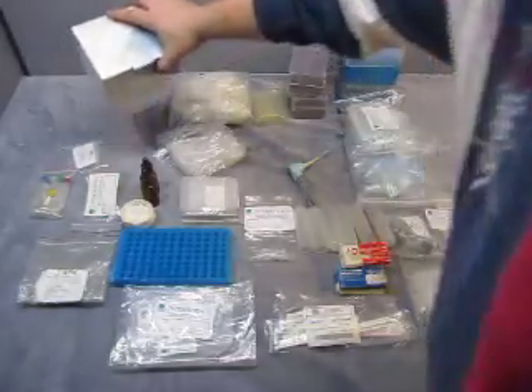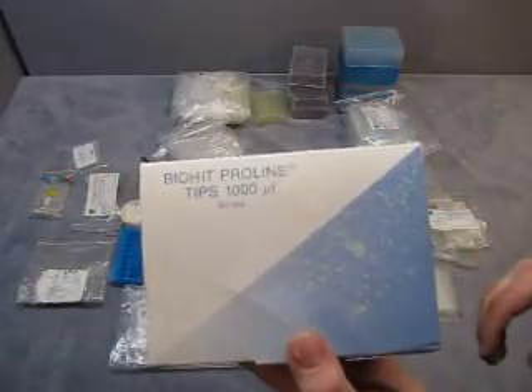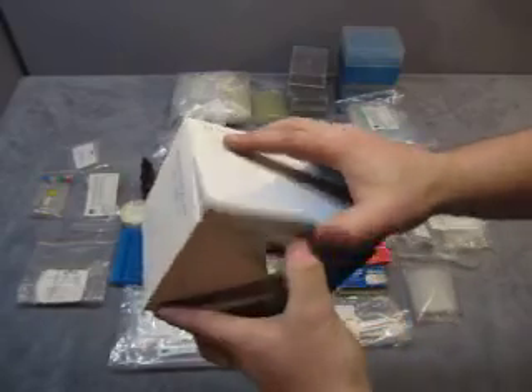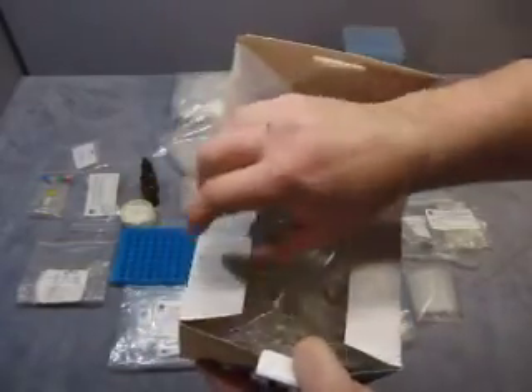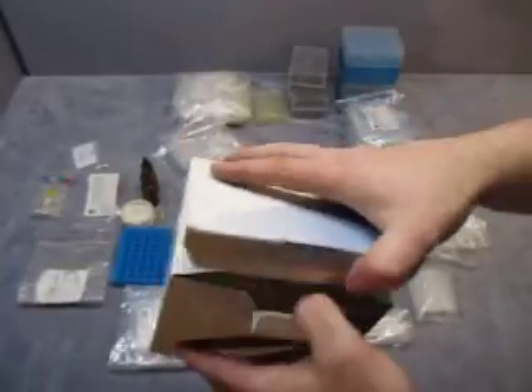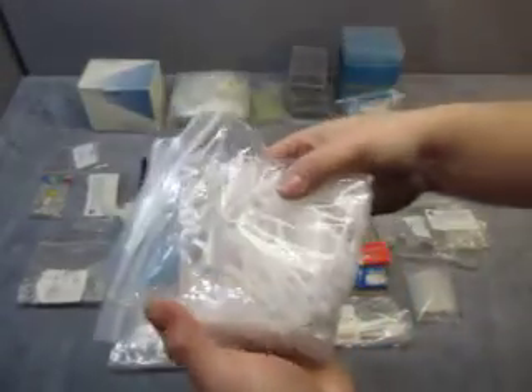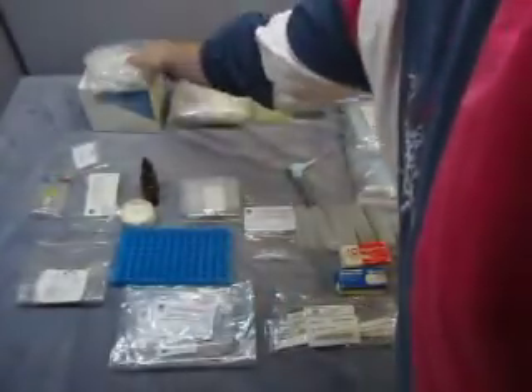First thing we have is Biohit ProLine tips, 1000 µL — there's 400 pieces in this box, though I'm not sure if they're all there. Then you get two more baggies that are 1200 µL, so those are included with it.